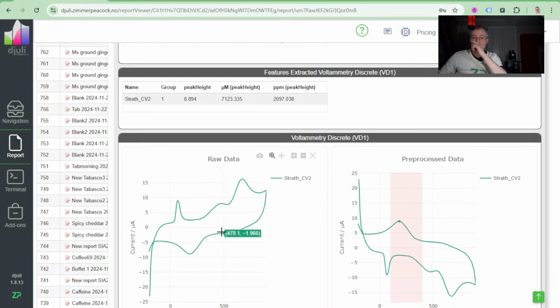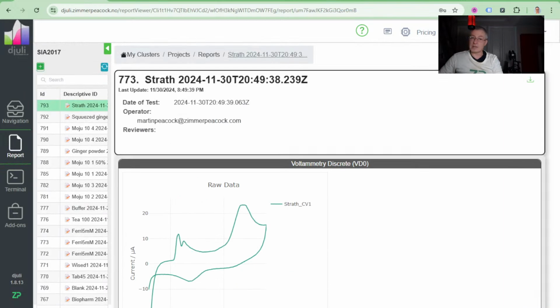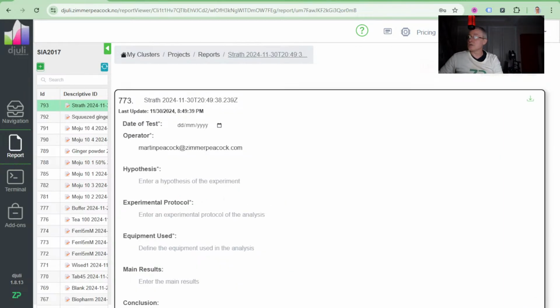I can see these very distinctive peaks, which tell me about the molecule I was interested in. It's a bit like the paper, because they had two distinct peaks in their paper as well. We've also analyzed a reduction peak. But if you own this potentiostat, you can program it every time to do what I'm about to show you.